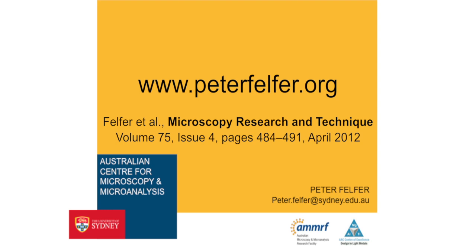What's the effect of ion damage? And also, what's in there is the geometry of how we do lift-out on grain boundaries, if you want to measure them sort of perpendicular to the measurement direction of the atom probe. And also the design of the holders is published. The design of the holders that I've been using in this tutorial is published in there. If you want to reproduce them yourself, you can find them in there.